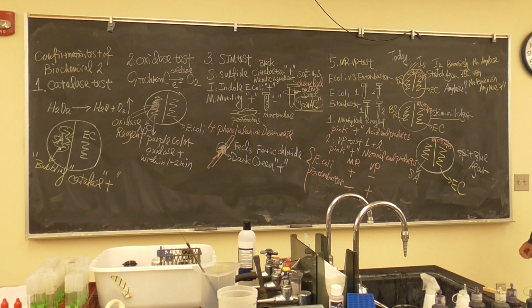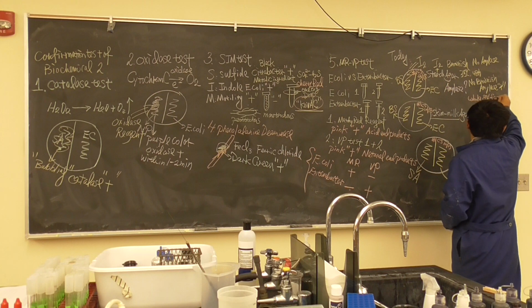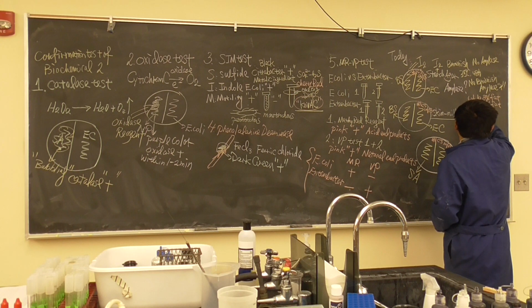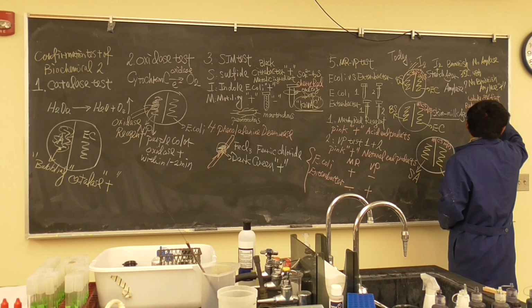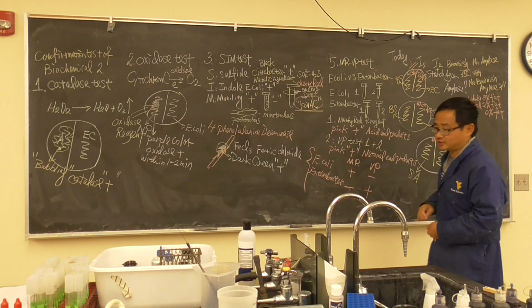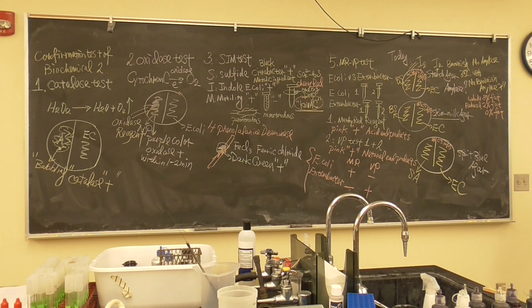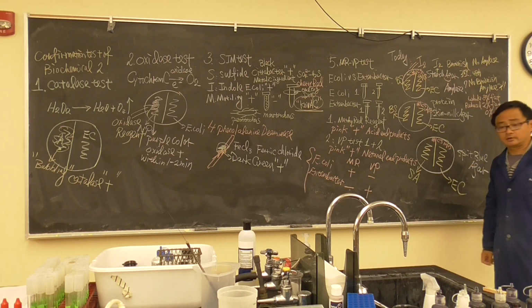Okay, skim milk agar, what are we testing for? You should know there are 3 different grades of milk. Do you know whole milk? 8% fat. And 2% fat reduced milk. We call it reduced milk. What is skim milk? 0% fat. Other than fat, inside of skim milk, which one is a major component? Of course, water is a major component. Other than that, what is that? Protein, is that right? Okay, protein. What is the major protein in milk?